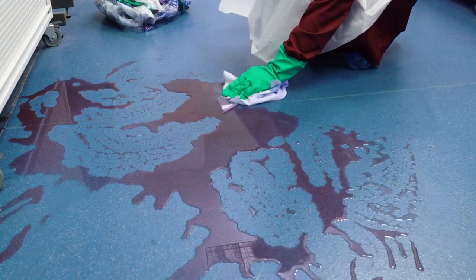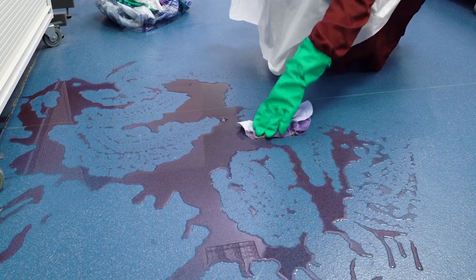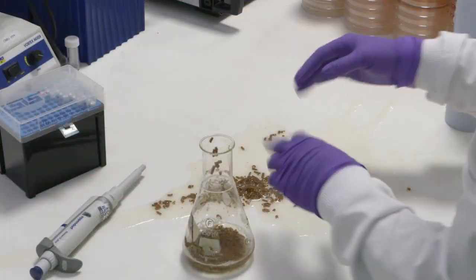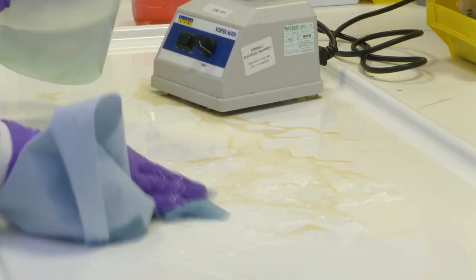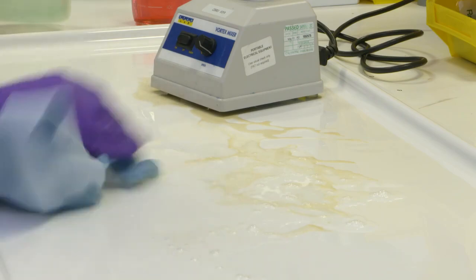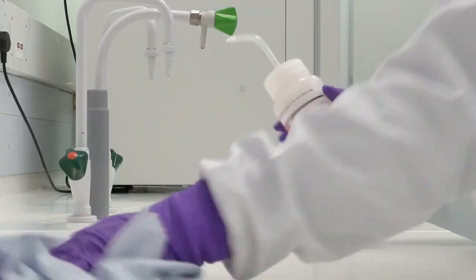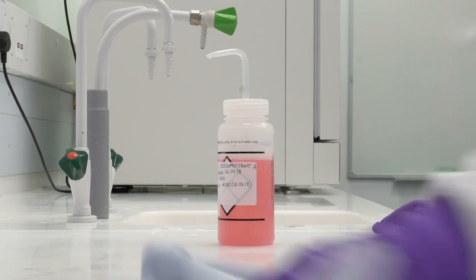In the laboratory, there are many surfaces and pieces of equipment that can become contaminated by biological agents or other hazardous materials. Decontamination is required to reduce the risk of infection or harm. Disinfectants, which are chemicals which can kill or neutralize biological agents, are often used for surface decontamination.